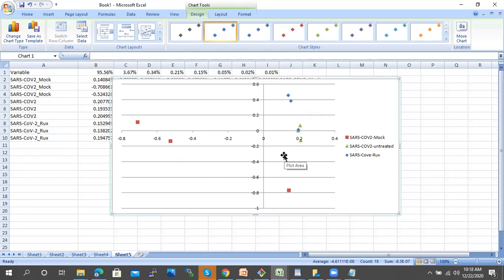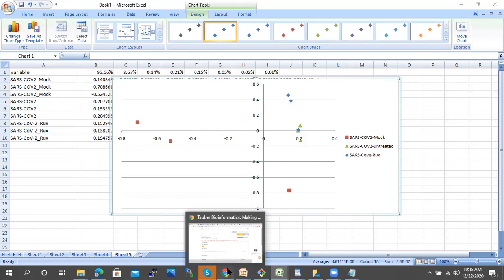We have used almost all the genes, except the genes with a zero value, so we have nearly 15,000 genes. Based on these 15,000 genes, we generated PCA components and visualized the distribution of the samples based on the PCA components using all the genes. So the next step, we can also identify important significant genes. How can we do that?